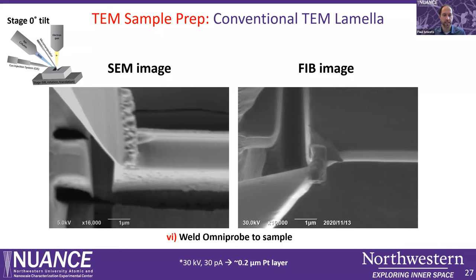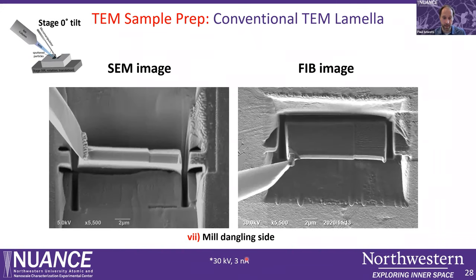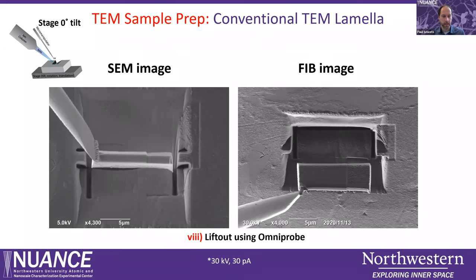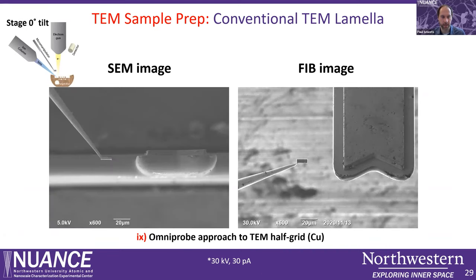The next process is to weld the omniprobe — the tungsten needle — to our sample using a bit of platinum, and cut the other side loose at increased current just as we did the J-cut. Then we drive the omniprobe in X, Y, and Z: we use the FIB image to drive up in Z, and the SEM image to judge position in X and Y. We image at lower currents so we do not create more damage to the sample, and then lift it out and approach one of the posts on our TEM grid.